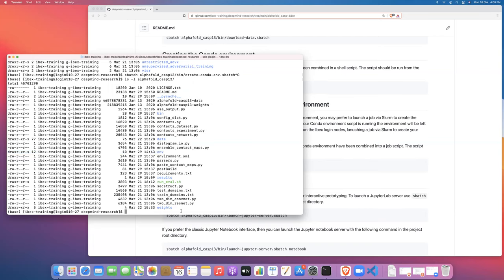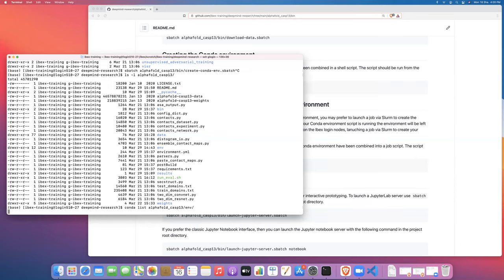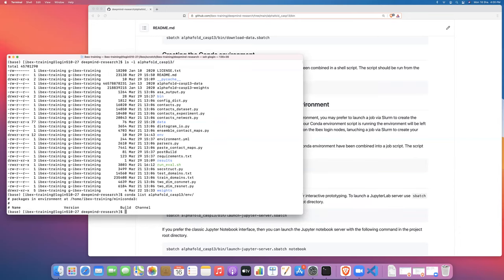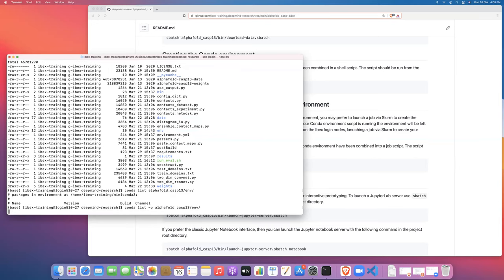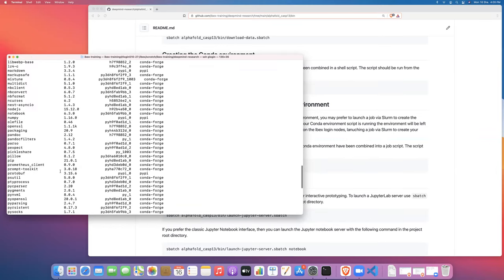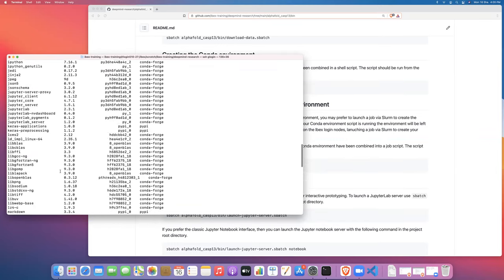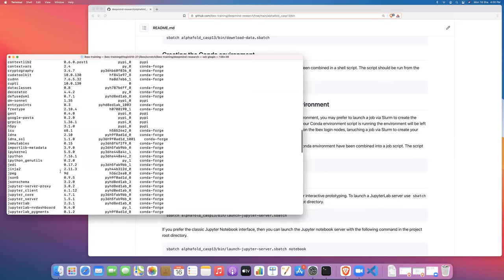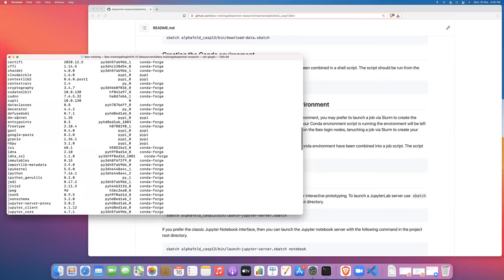We can see the contents of this environment by doing a conda list and then the path to the environment. So in this case, alphafold_casp13/env. Maybe I need to prefix. There we go. And if we look in here, I'm just scrolling up. So here's our CUDA dependencies.